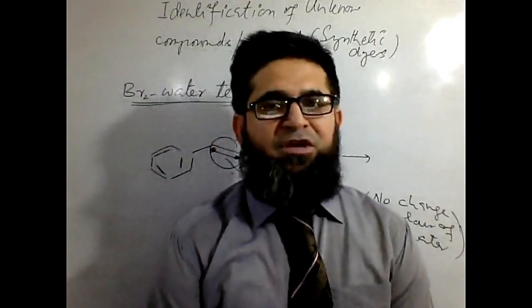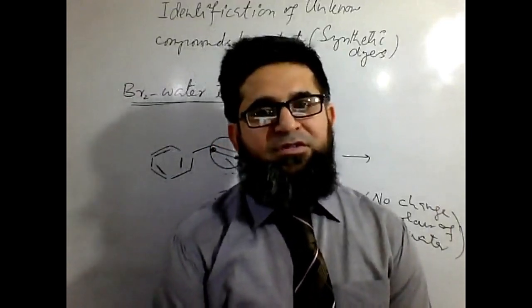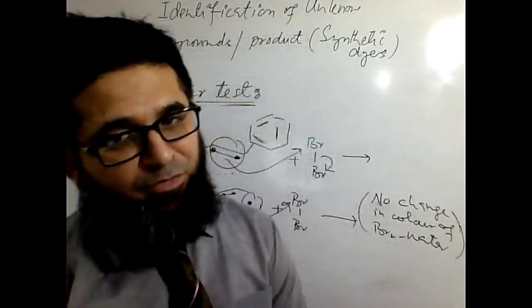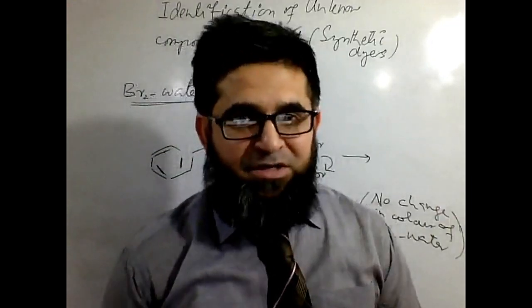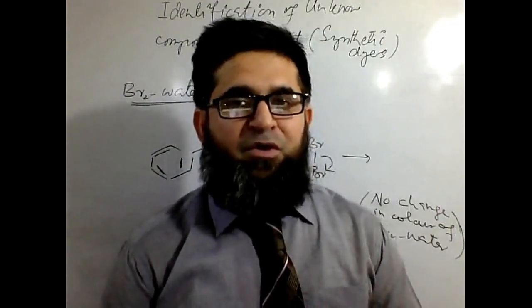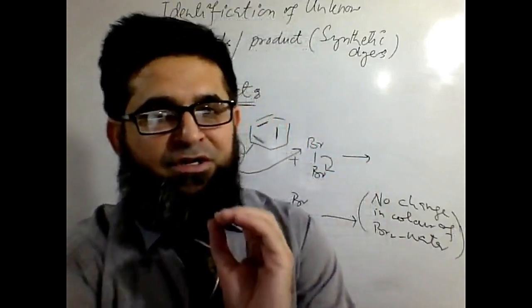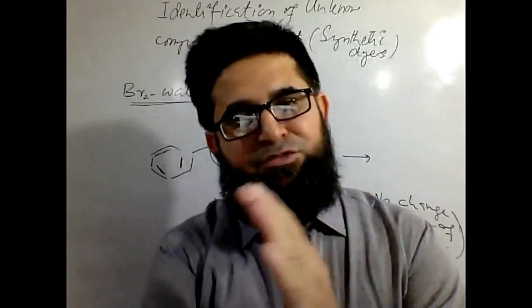Whatever the chemistry of the molecule, bromine reacts only with double or triple bonds. Once it reacts, the bond between Br and Br breaks down. The breaking of the bond results in the disappearance of the original color of bromine, which suggests there is some sort of reaction.